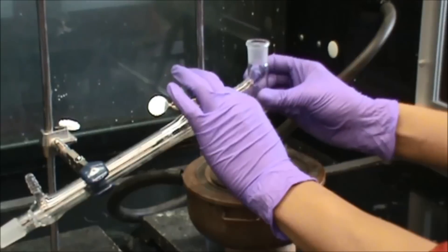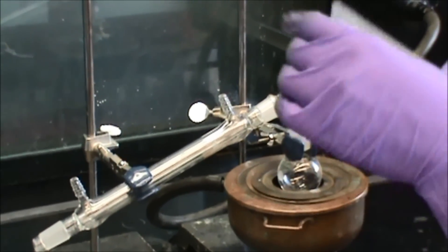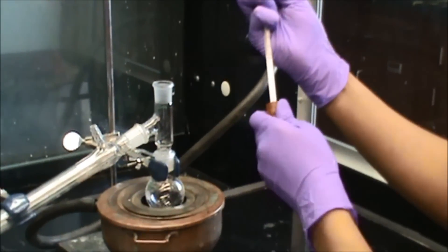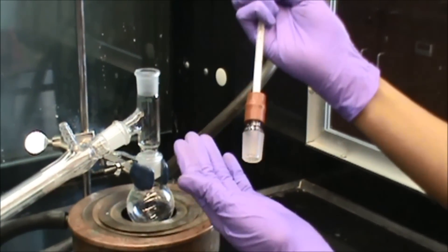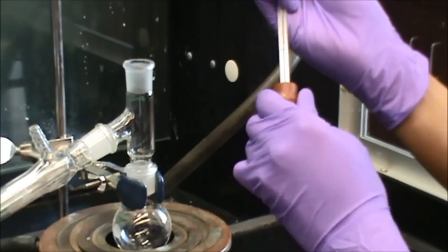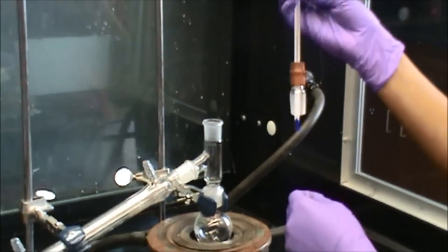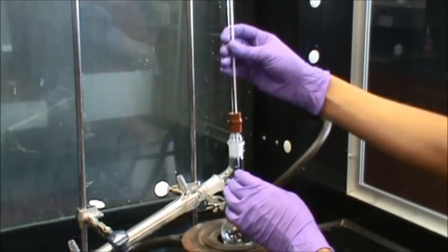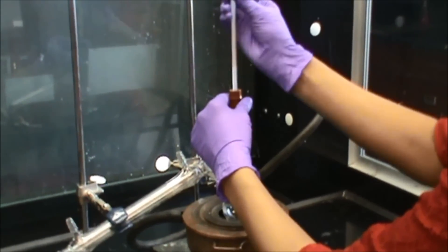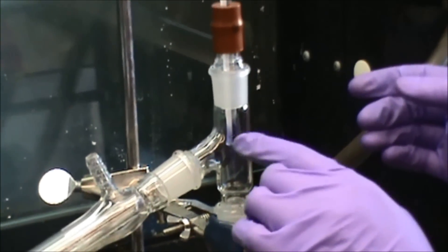Now you connect the distillation head to the condenser like this. I'm going to take the thermometer and the rubber adapter and place the thermometer through the rubber adapter. When you are doing this, make sure you go in really slowly so you don't break your thermometer. Now place the thermometer into the distillation head, and make sure that the tip of the thermometer is right at the side arm of the distillation head.